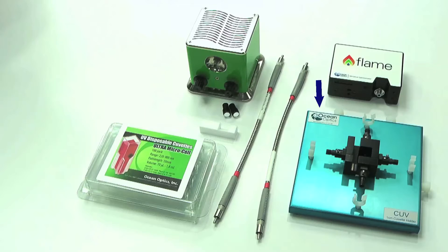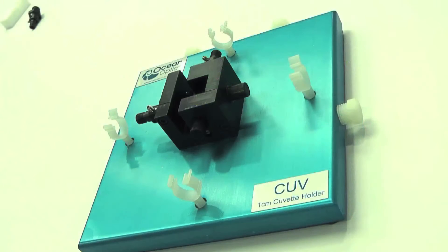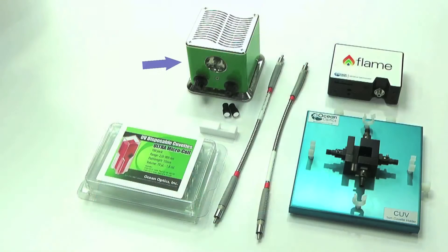A CUV cuvette sample holder with two 74-UV collimating lenses positioned at 90 degrees to each other. Two mirrored screw plugs positioned opposite to these lenses. This helps to maximize the fluorescent signal. And an Ocean Optics LLS light source containing an LED which gives out light at 470 nanometers.